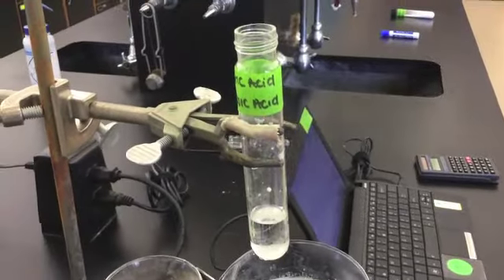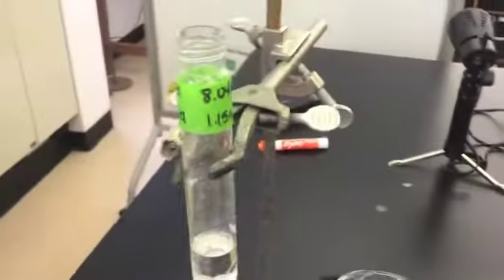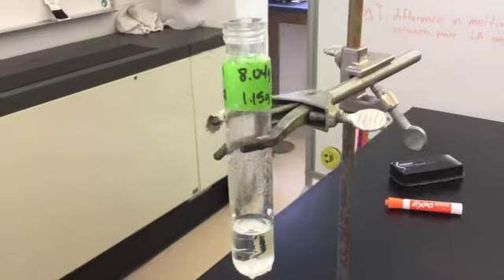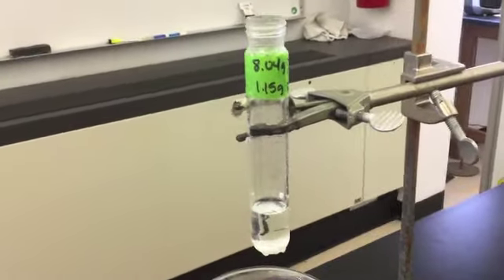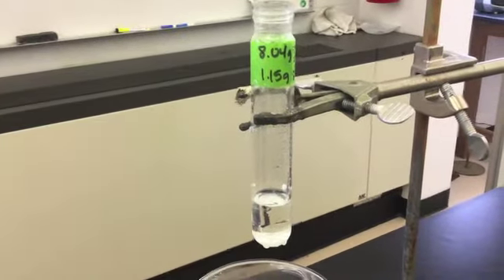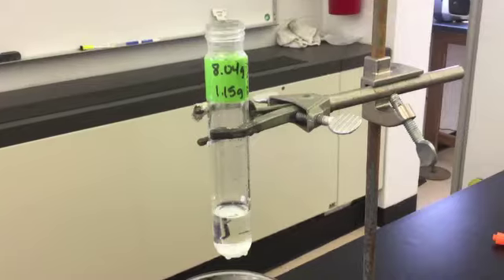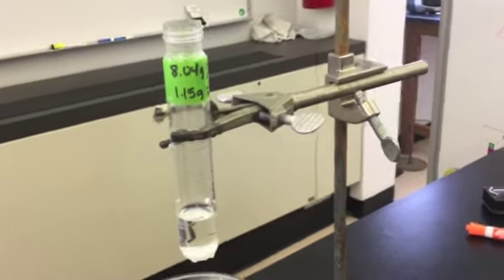We will now proceed to melt the lauric acid and benzoic acid mixture. This will have a green label. Be sure to record the mass for both the lauric acid and the benzoic acid. The mass for the lauric acid does not need to be the same mass that was on the original test tube. Pure substances melt at the same temperature regardless of the mass. It is only the lauric acid in this test tube whose mass matters.